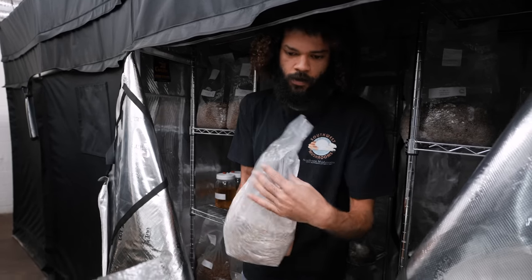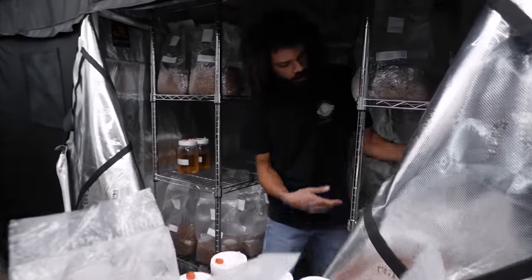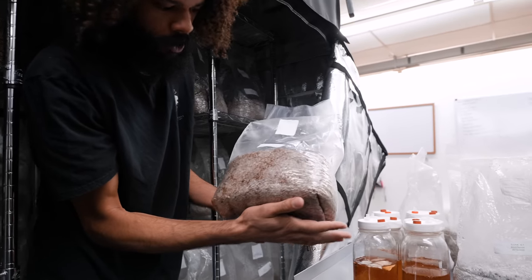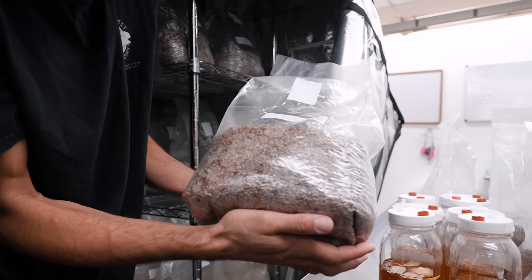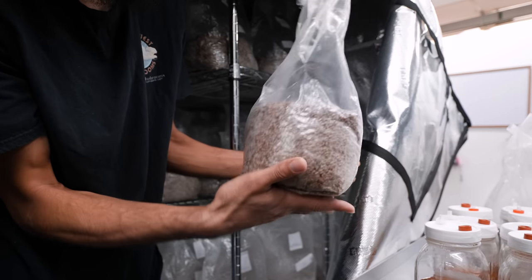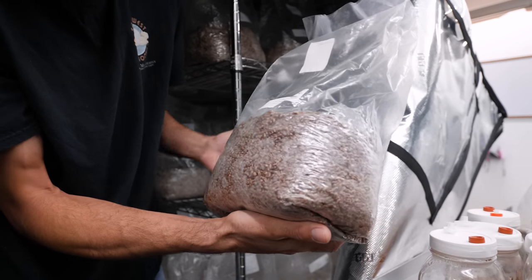Just taking a look at which bags I'm going to be utilizing. We've got some reishi, some oyster mushrooms — actually a white elm oyster. We have some bags that are almost fully colonized. This one was inoculated on 9/16, so it's been about eight days, and this is the pink oyster. It was actually inoculated with a liquid culture, and the mycelium is growing throughout the bag pretty evenly, so it's about to finish up.